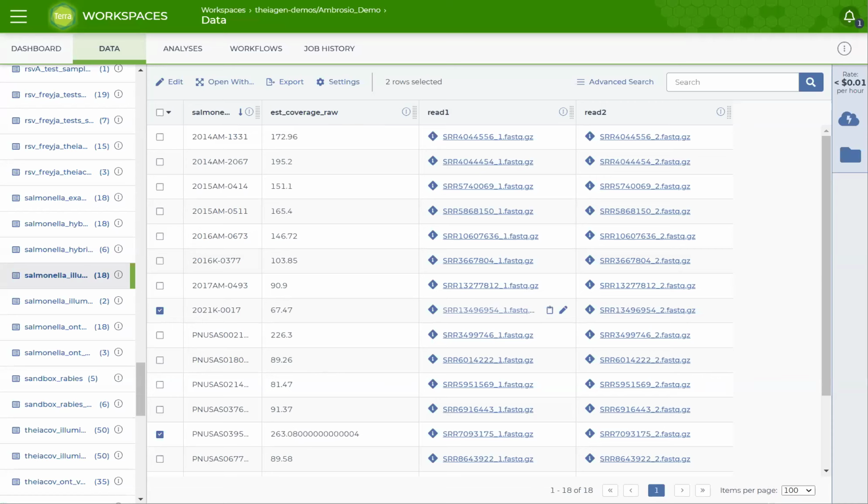So, let me correct myself there. If you have low quality sequencing data, you are really going to want to make sure you have more wiggle room. That is going to be the main factor that determines how much sequencing data is removed during the cleaning process. So if you have a significant amount of low quality sequencing data in your FASTQ files, you are going to want to not downsample anywhere near the minimum threshold for the estimated depth of coverage clean.